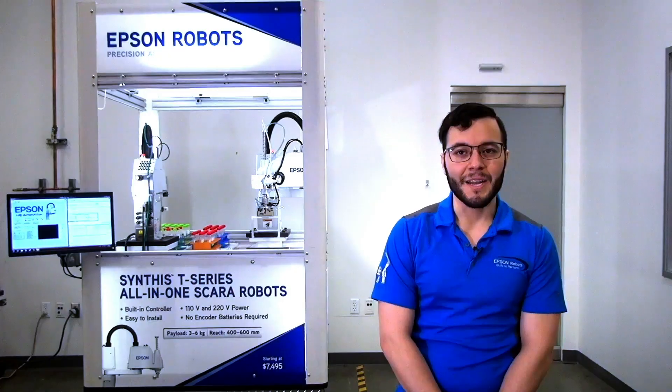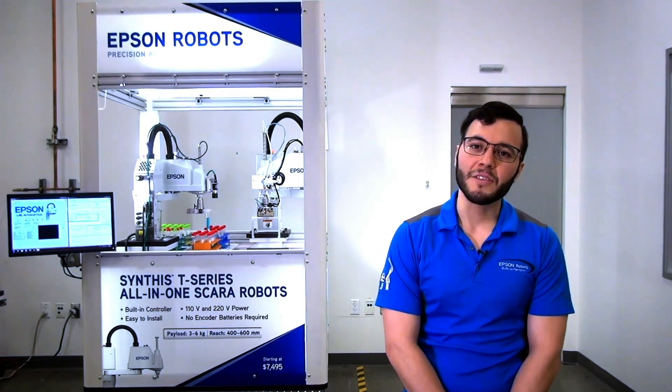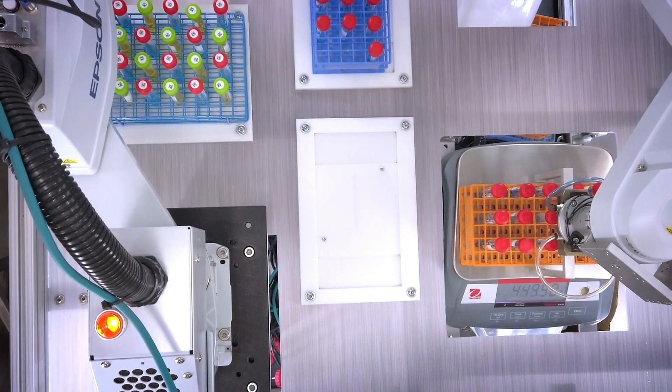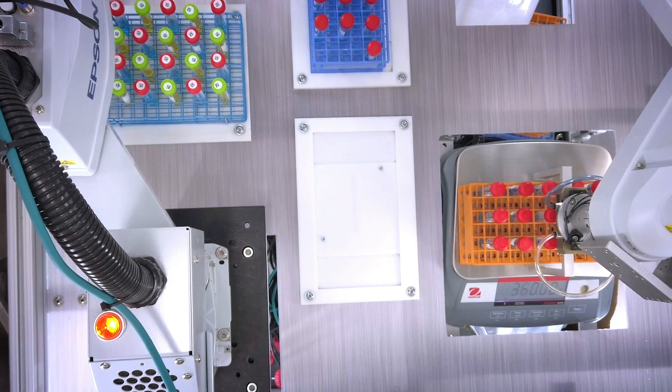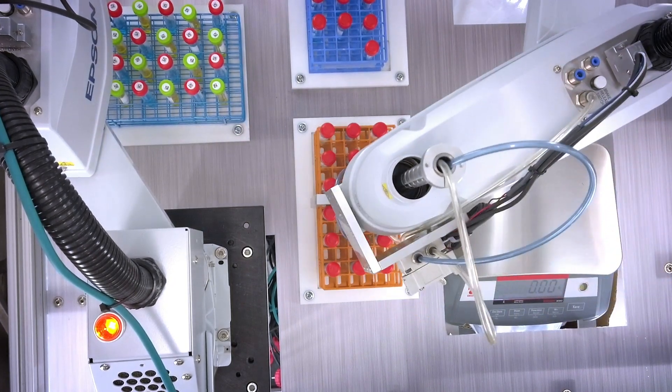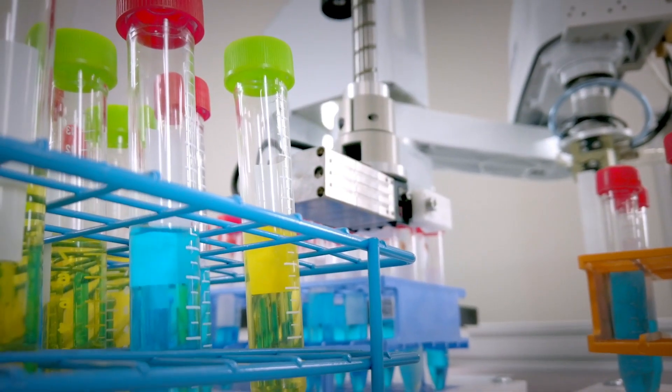The T6 robot is taking a test tube rack to a weight scale and verifying if the rack is fully populated. If it is not fully populated, then the robot returns the rack back to its original position and the T3 robot picks and places test tubes from a different rack and places them onto the moving rack.